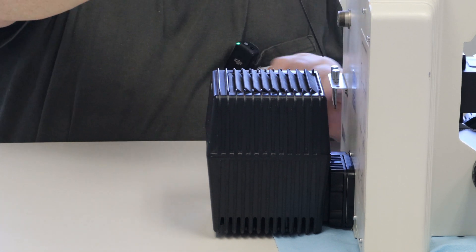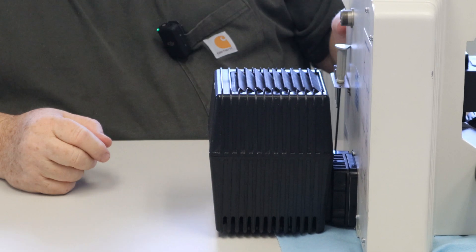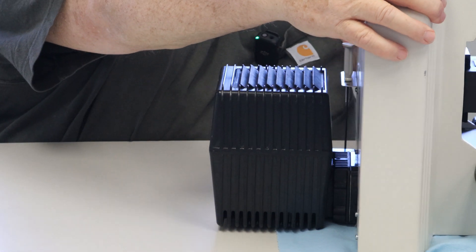And now you have successfully changed the light bulb on your E600 Nikon microscope.